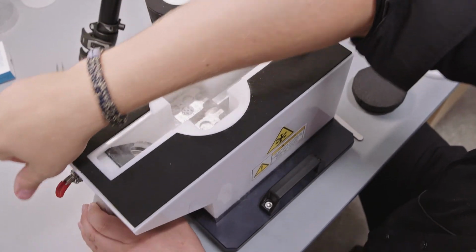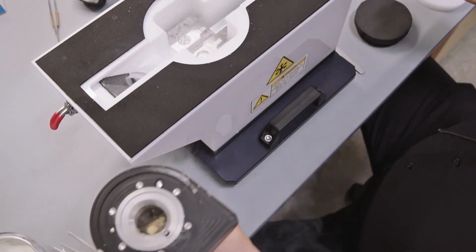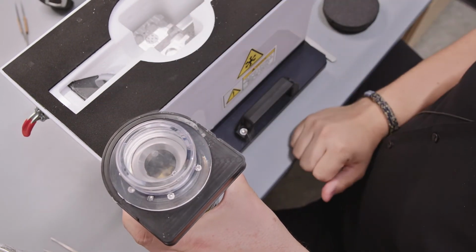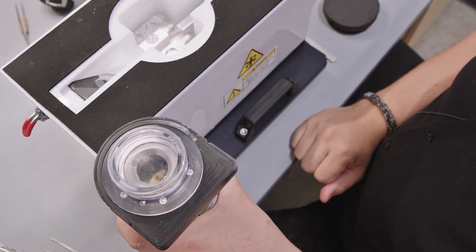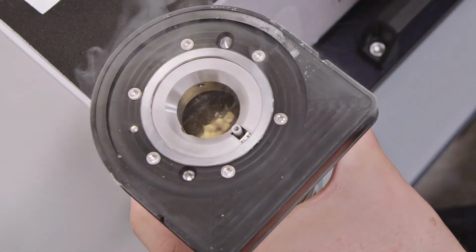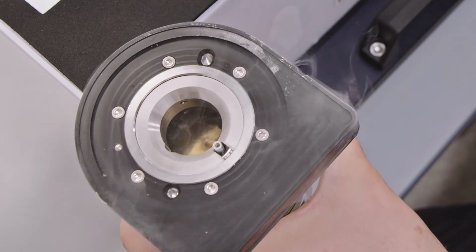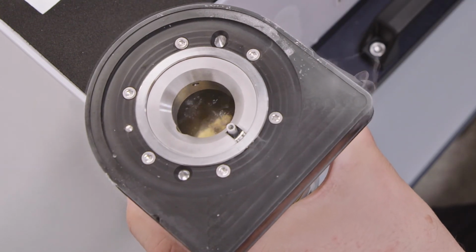And you can now release the capsule again and place a lid on it and move to the microscope. Always make sure after you've done this to check if this pin is still moving up and down to make sure it's not frozen.